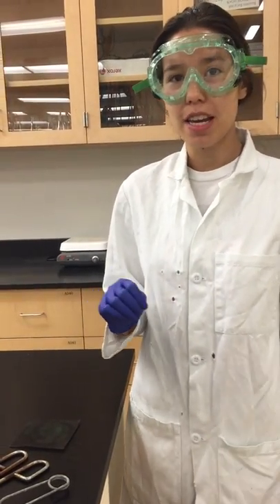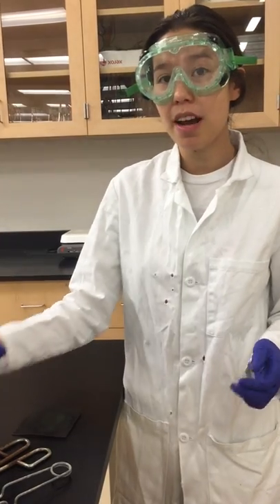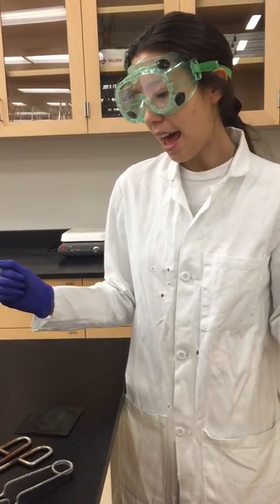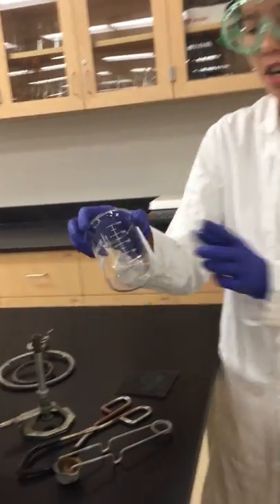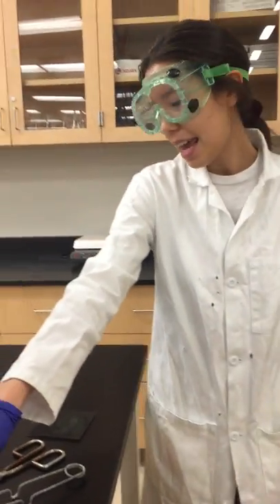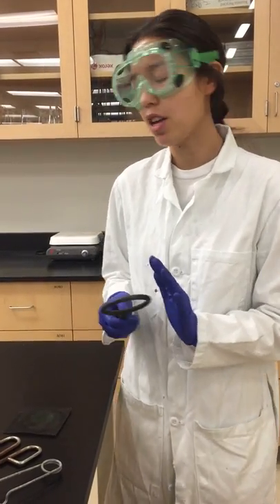My TAs' names are Ying and Banaz, and the safety precautions for this lab are: never ever leave a flame unattended. If the flame does burn out, turn off the gas immediately, and make sure there are no flammable things in your area. Check the beaker to make sure there are no defects, and don't touch the metal ring stand unless you're sure that the air around it is cool.